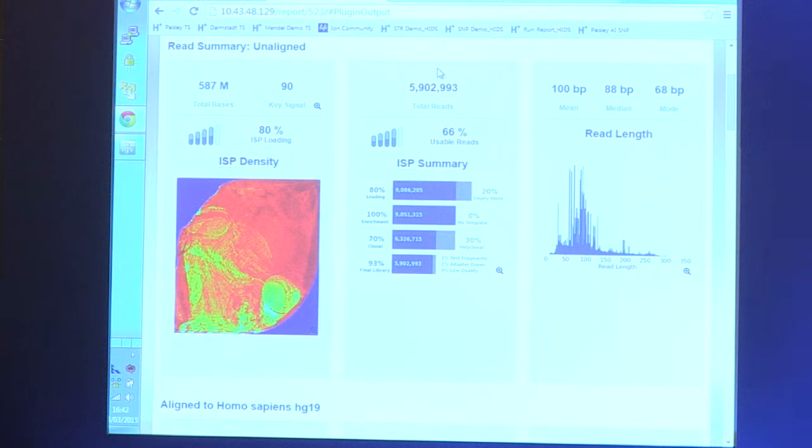Okay, so moving on then. We look over here and we start to see some statistics on the read length that we have achieved. We have a histogram of how many reads we managed to sequence plotted by the read length that we achieved. So this, of course, will be characteristic of the multiplex that you've used.